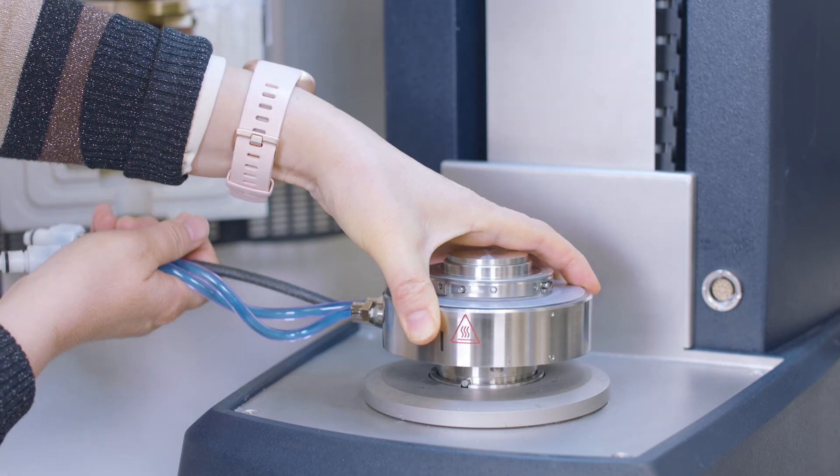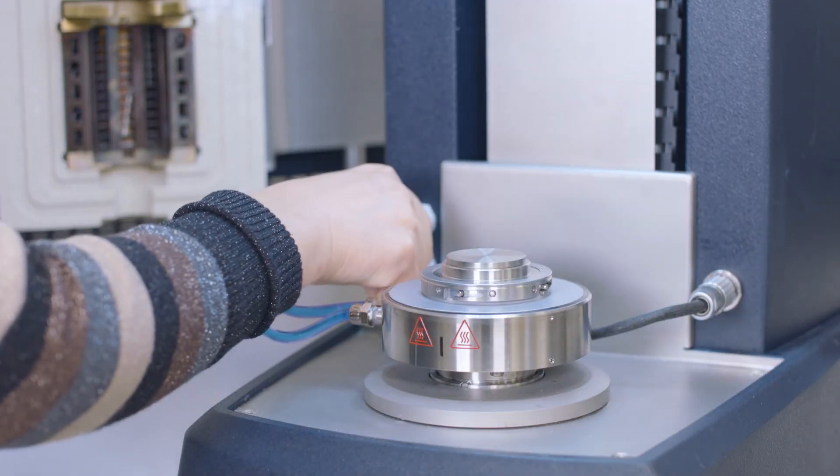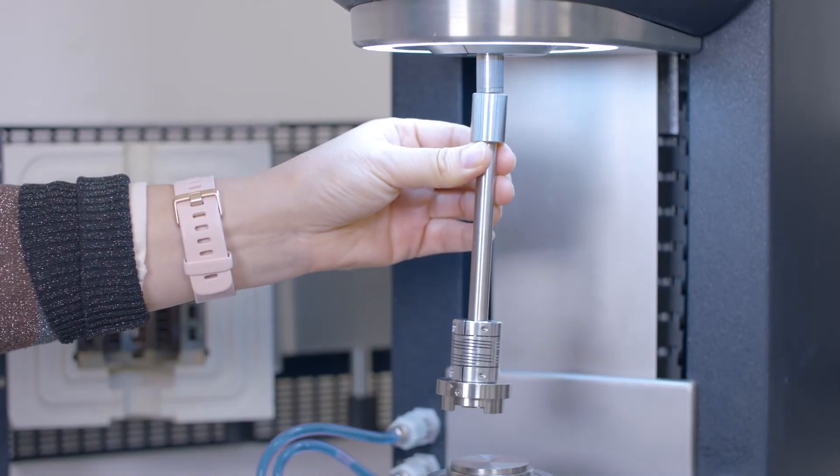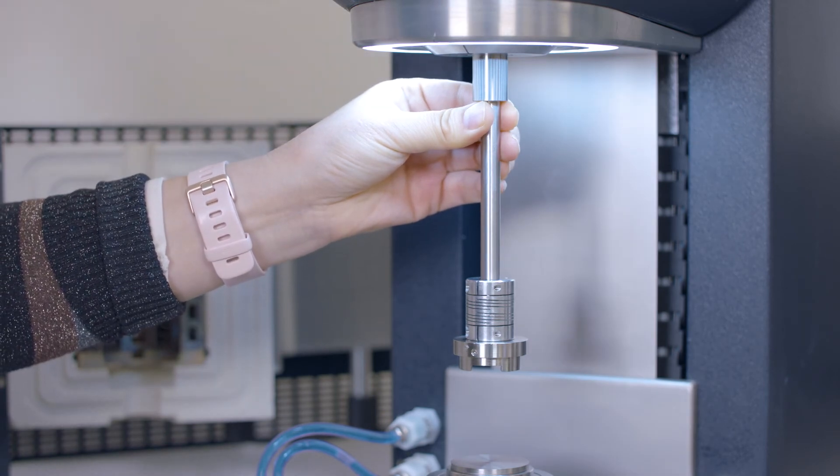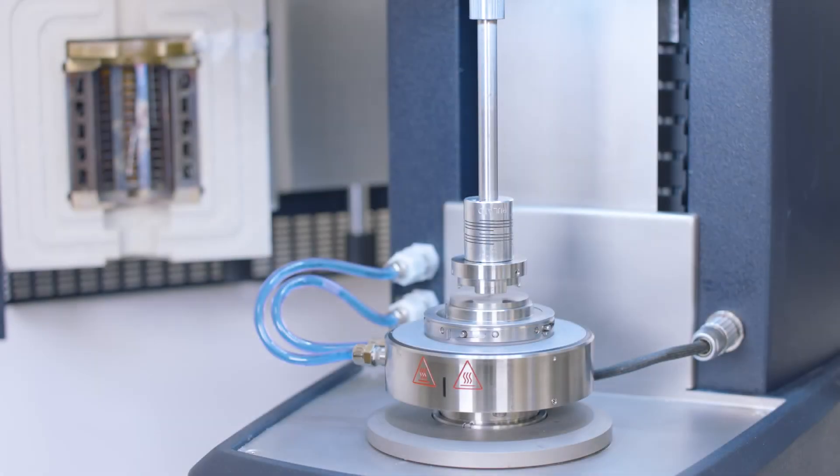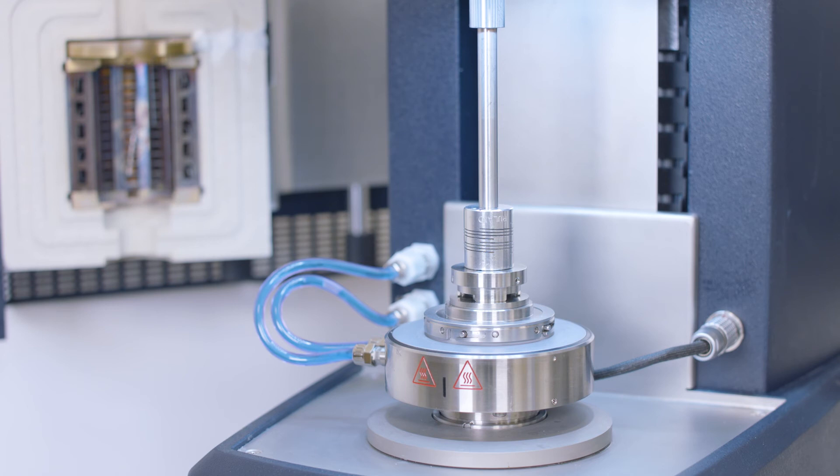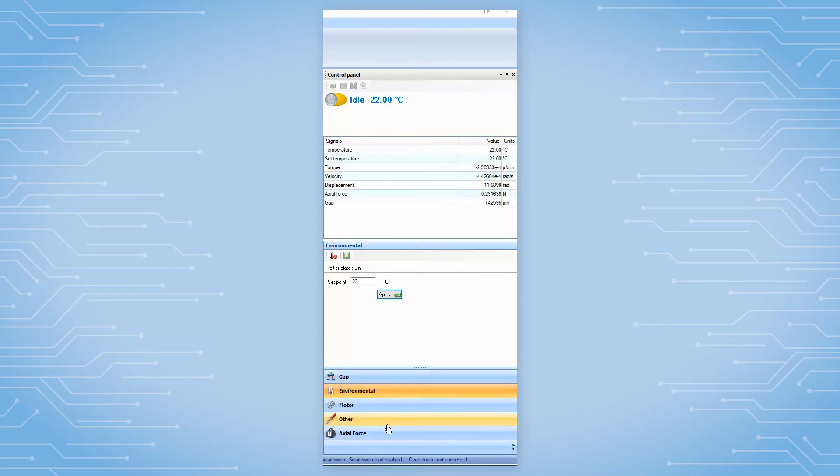Setting up a tribological rheometry test on a Discovery Hybrid rheometer is very straightforward. First of all, after attaching the upper and lower geometry to the rheometer, users need to zero the gap. If needed, from the TRIO software control panel, also zero the axial force.